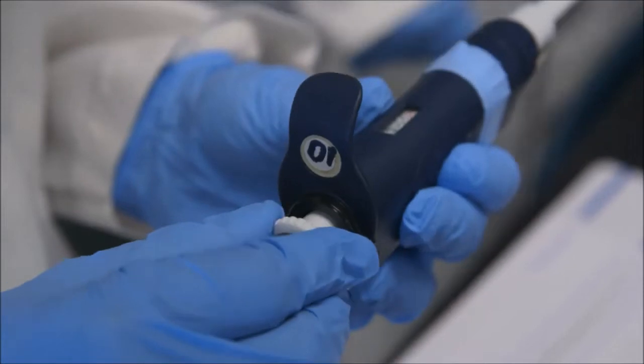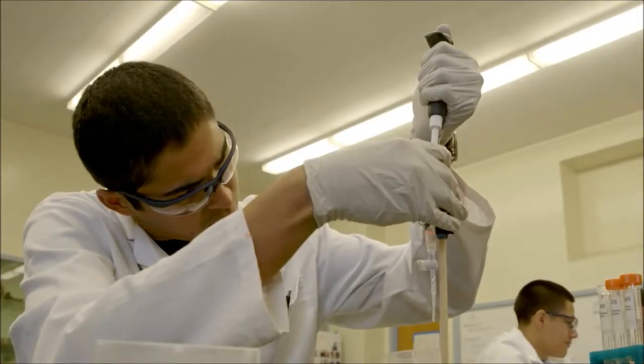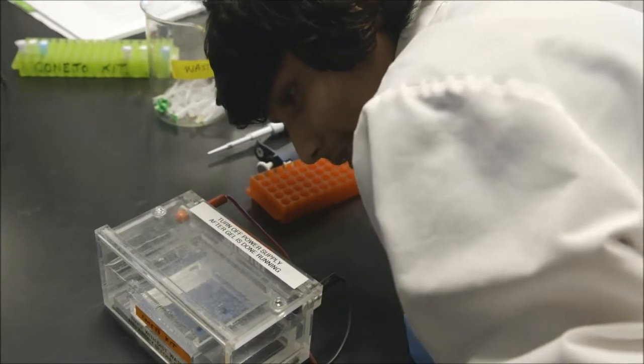You can't really learn how to use a pipette without ever grabbing and touching one. You wouldn't know that there's two stops to it. You'll know, but you won't be able to really know until you feel those two stops on a pipette. You're interacting with it, and you actually learn what it means to actually be a scientist with all of the equipment you're using and what the professionals actually use as well.